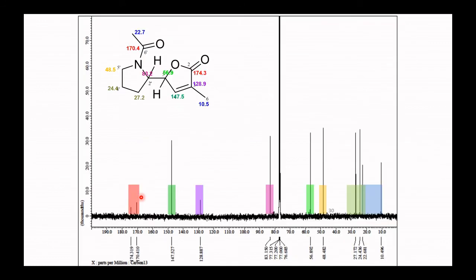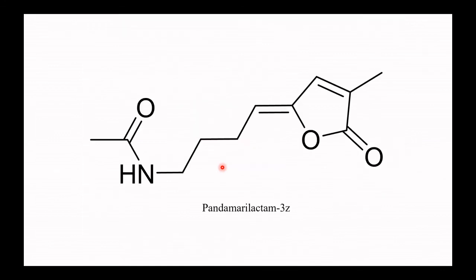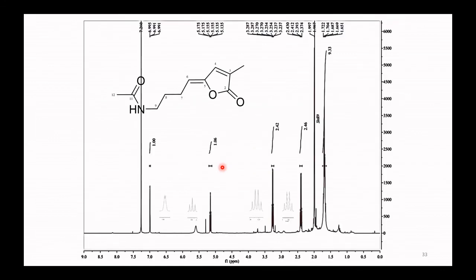Go to the COSY spectrum, and before you see, now you can expect which protons you could see as adjacent, and you can make a square. You can practice here by yourself, right? If you see it like the solution, first square, second square. Now we go to another example, right? Can you do the assignment by yourself?